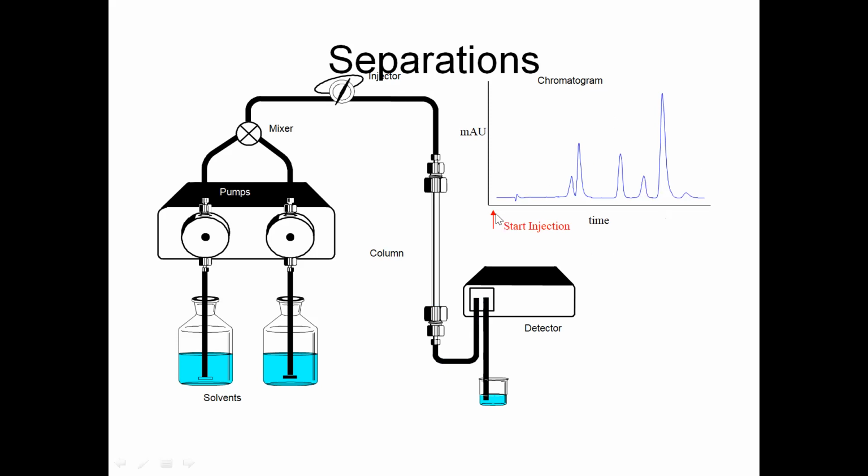On the x-axis you have time. This is called retention time. It tells you which compound is coming out of the column. So you can say this is the compound which is having the lowest retention. This has the lowest retention, and it will have the lowest RT, maybe say around 3 minutes.